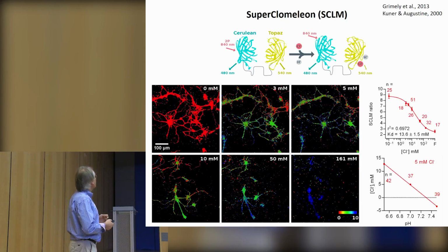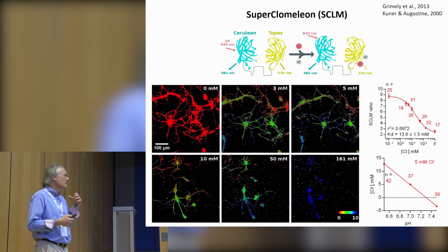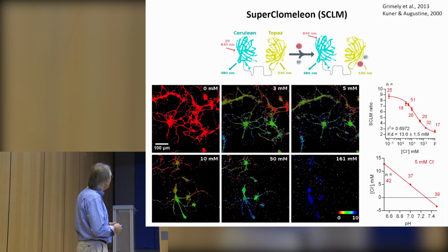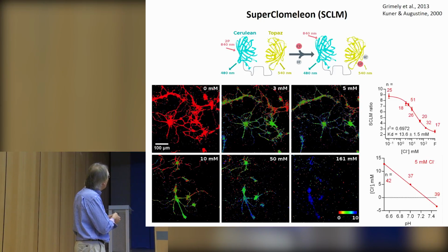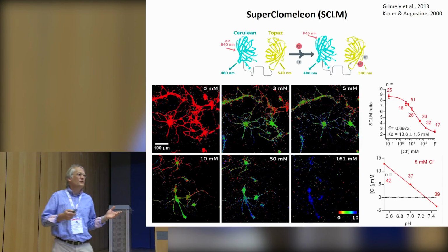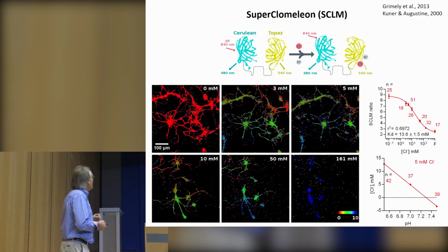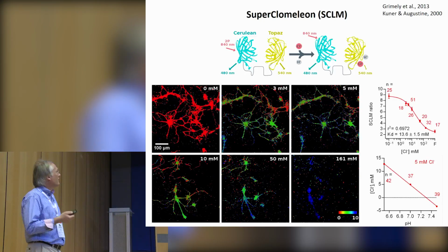And I already alluded to this sensitivity of the construct to protons, because the effect of chloride binding is mediated via changes in protonation of the fluorophore. And the effect of unknown pH changes, let's say you have calibrated your indicator for pH 7 and you read out a certain ratio that you have calibrated to 5 millimolar chloride, as shown here. And now if your cell suddenly changes pH from, let's say, 7 to 6.6, then of course you will read out 10 millimolar chloride, although the chloride didn't change. So it was only a pH change. So this is something one has to be aware of with this system. This makes imaging a bit challenging with this indicator that it's both chloride and pH sensitive.